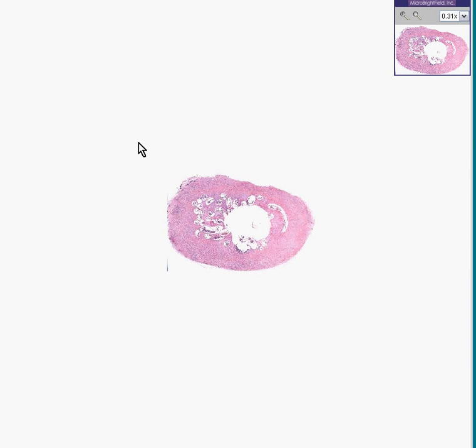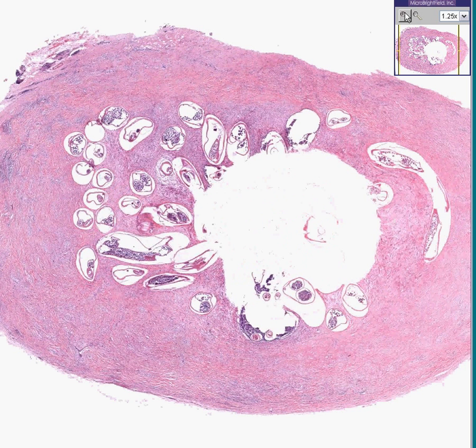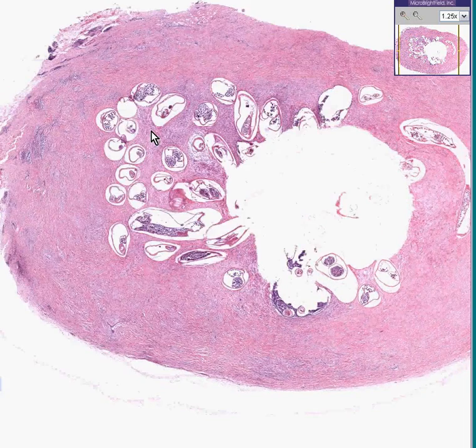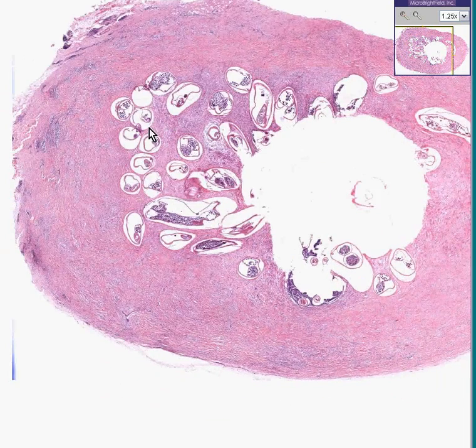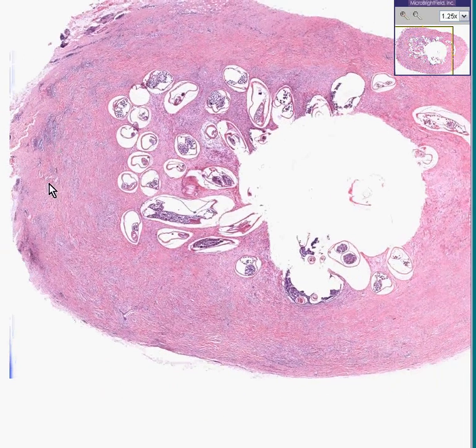When you first look at this piece of tissue here you think you might be dealing with some kind of organ that has lumen and mucosa in the wall, but as you zoom in you could quickly see that's not the case at all. You're dealing with something that is extensively fibrotic.